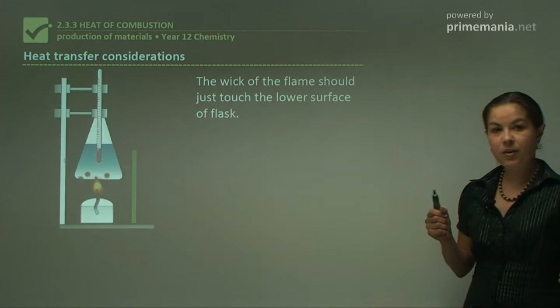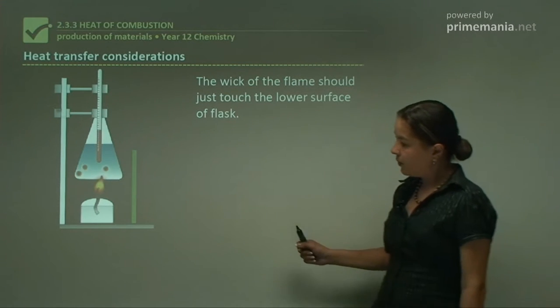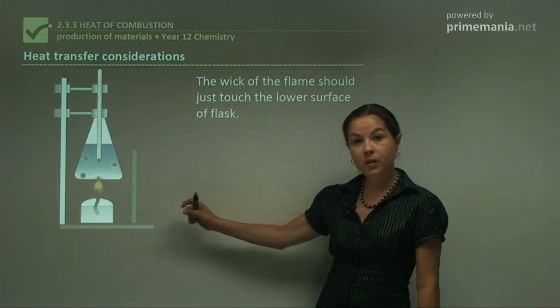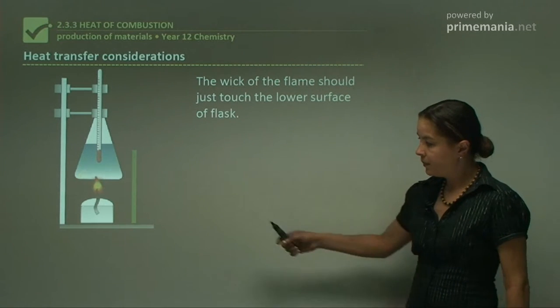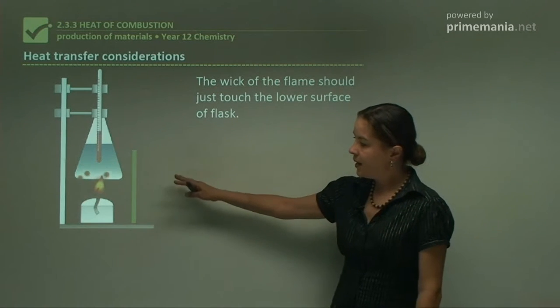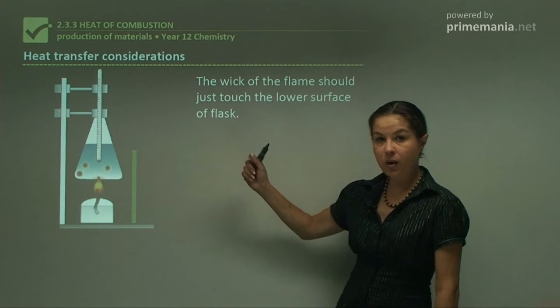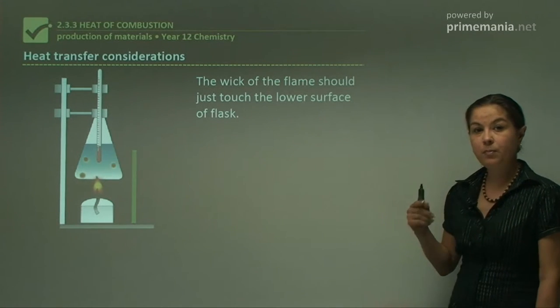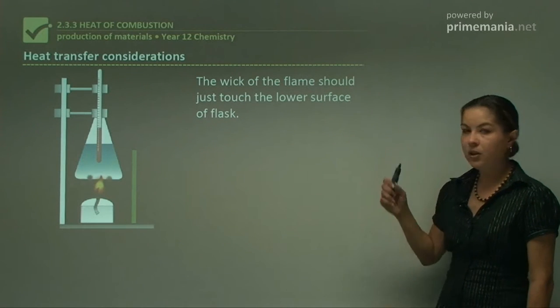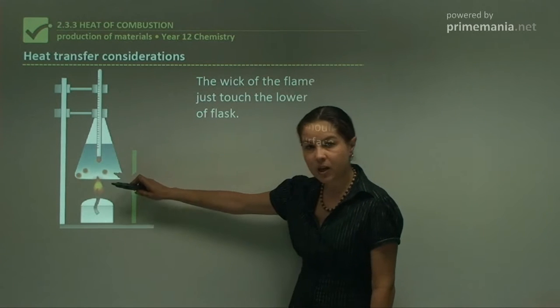Now let's look at the heat transfer considerations of this setup. What we have here is our setup with our spirit burner at the bottom with a set amount of alkanol, and the wick will burn that alkanol, and the heat will transfer to the water where the temperature will rise. But what we need to consider are a few experimental factors. The wick of the flame should only just touch the lower surface of the flask. So as you can see here, it's just touching.